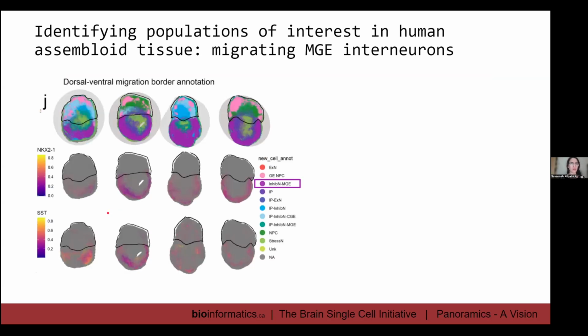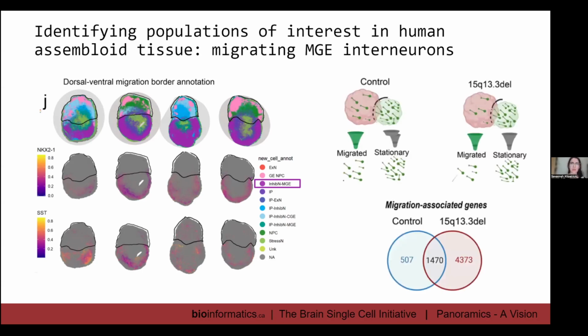And the next thing I want to show you is kind of a demo of this package that I really like called SPATA2. So SPATA2 allows for the regional identification of different cell types or domains. It's very hands-on, and it's actually very user-friendly, which is why I want to give you a demo today. But just to give an understanding for our motivation, we're looking at isolating our migrating cells. So instead of providing the exact coordinates of those migrating cells, we can instead create these regions of interest via SPATA2 and then isolate the migrating cells that way.